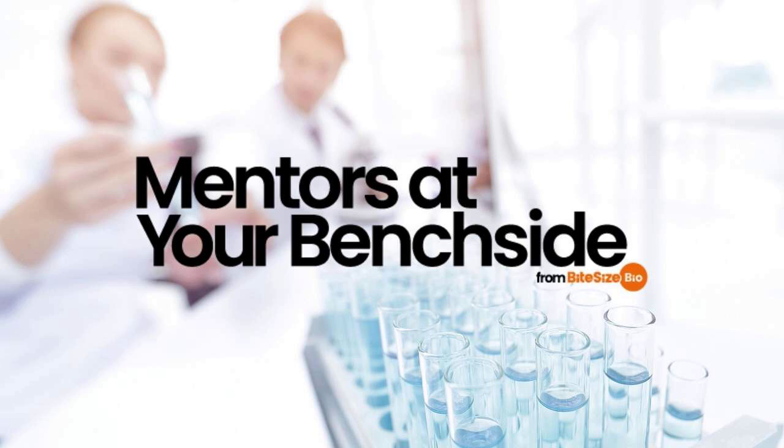How long will my cells last once fixed? You'll be pleased to hear that cells in ethanol are stable at 4 degrees or minus 20 degrees for months. For formaldehyde-fixed cells, that is reduced to around 1 or 2 weeks. Unlike ethanol-fixed cells, which can happily sit in ethanol all the time, we should spin cells out of the formaldehyde after 20 to 30 minutes of fixation, as prolonged storage in a fixative will increase autofluorescence. After this, they can safely be stored in phosphate-buffered saline.